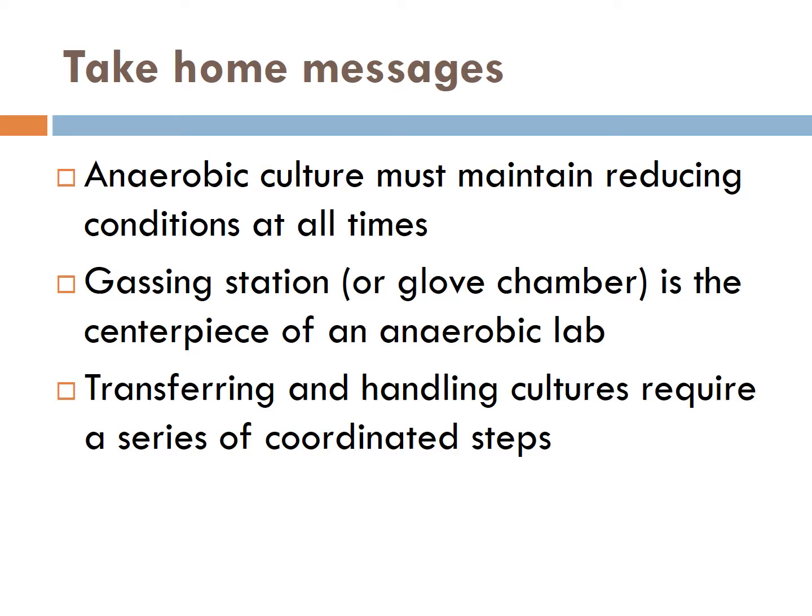The take-home messages from this lecture are that anaerobic culture must maintain reducing conditions at all times. The gassing station, or glove chamber, is the centerpiece of an anaerobic lab and where all procedures are performed. Finally, transferring and handling cultures requires a series of coordinated steps.